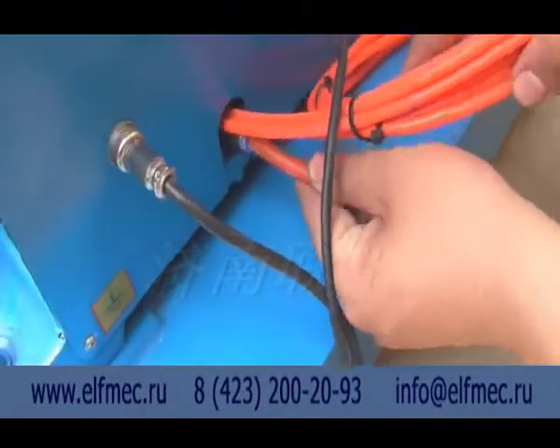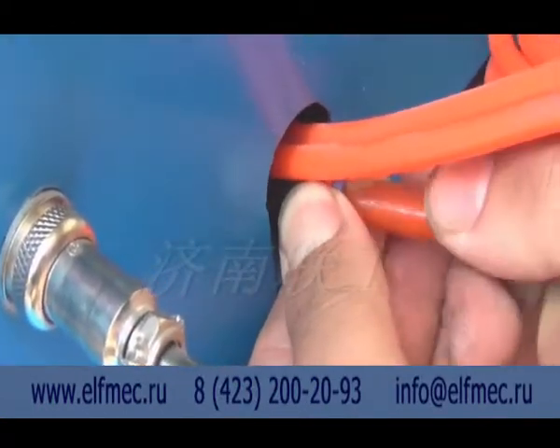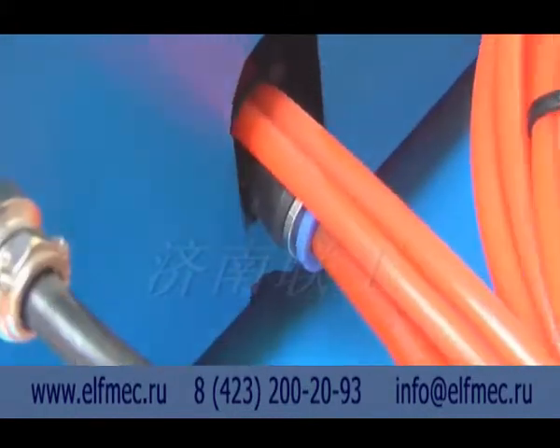Connect the air pipe head with the air quick-connect plug at the back of the host. Connect the two marked air tubes on the back of the host and the automatic feed sealant connector accordingly.